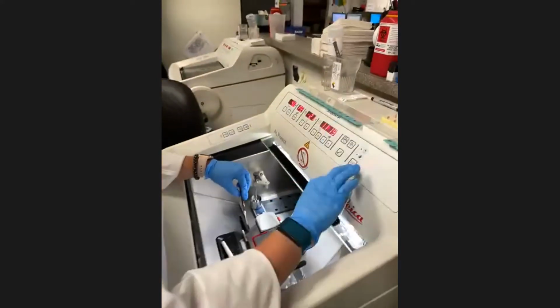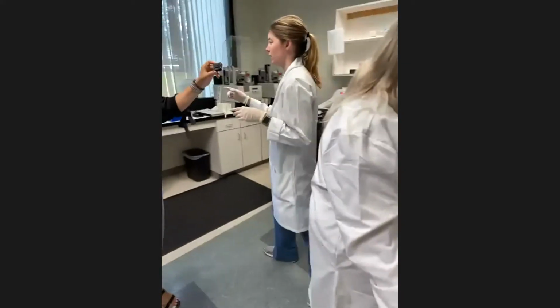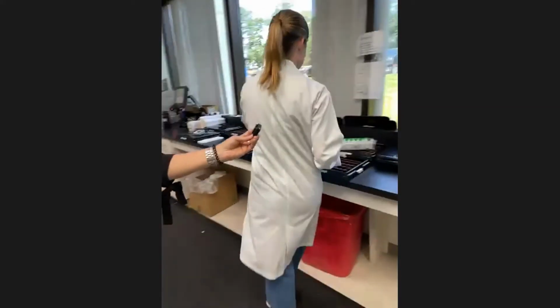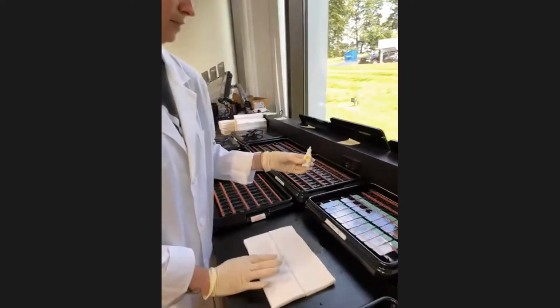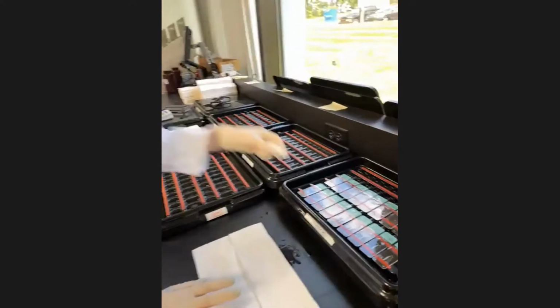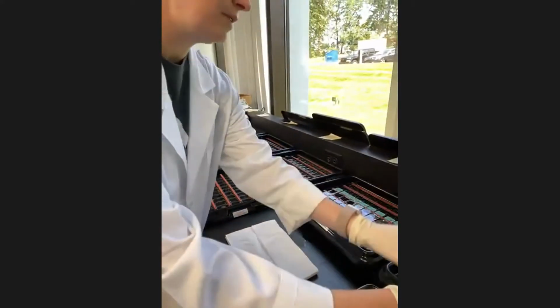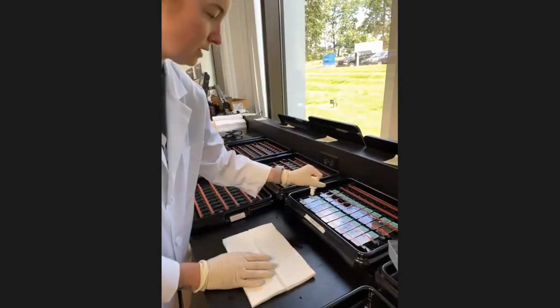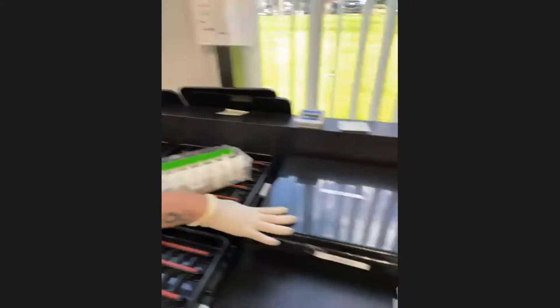All right. And then after they get done cutting, when we get 6 jars, we then move over here to where we stain. And I've already got 2 cases set up here to stain. So what we're going to do is we apply each antibody. This is IgA, so we apply it on the IgA slide. So we just do a few drops per slide. And we stain all 9 slides with the case, and then they sit in these boxes like these over here that are covered for 30 minutes.